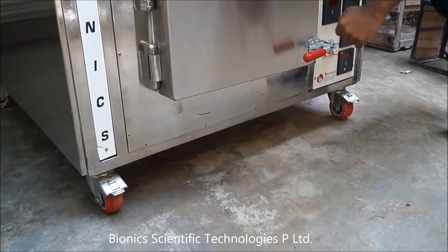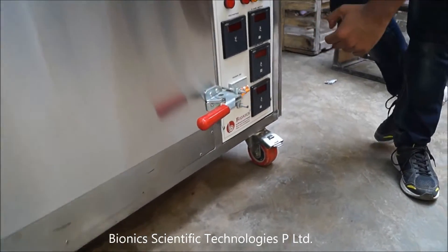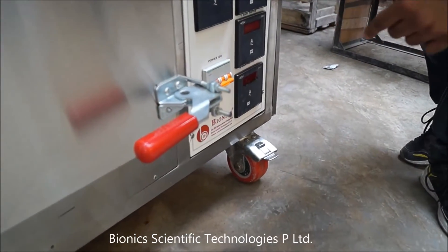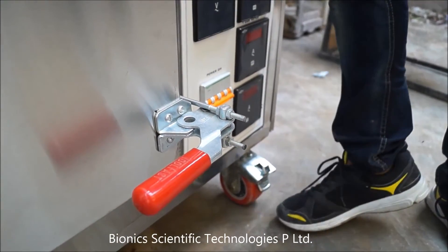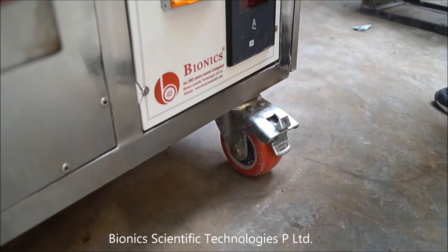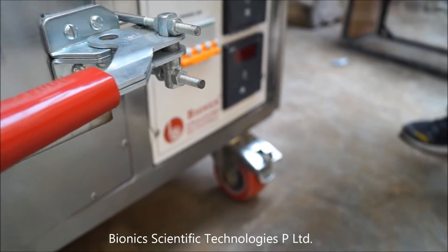The first 2 wheels are lockable. These wheels can be locked by your foot like this, which makes the Muffle Furnace stable and the machine will not move anywhere.